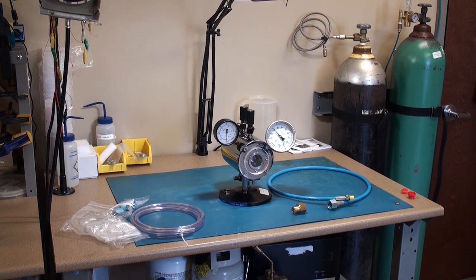Hello, this is Al Koretz. I am applications and service manager with Electron Microscopy Sciences. Today we will be doing an overview of the E3100 critical point dryer made by Quorum Industries. We represent Quorum here in the United States.